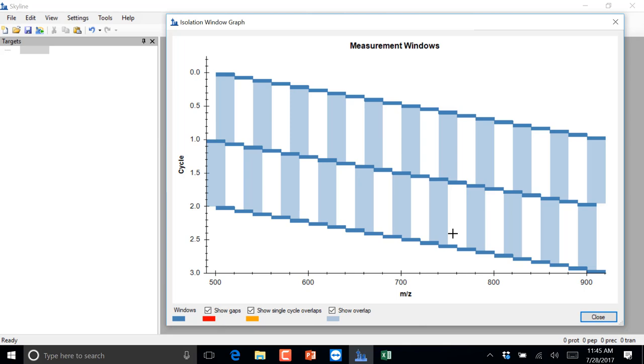So Skyline says, well, I need to fully sample everything in the range that the user asked for. So it's going to tack on this little extra window because we're losing that part. So that's going to be a 21 scan cycle, and the loop count should be set to 21 if you're using the overlap. But if you're not, set it to 20, because if you weren't doing overlap, it would just output a list of 20 windows.